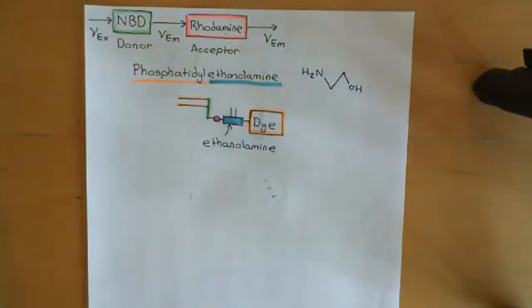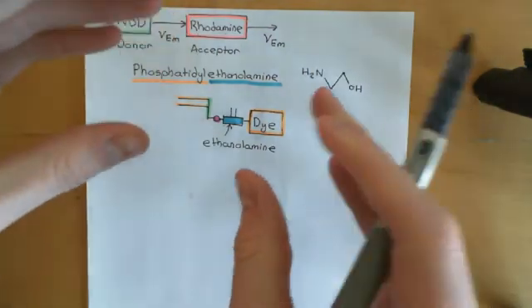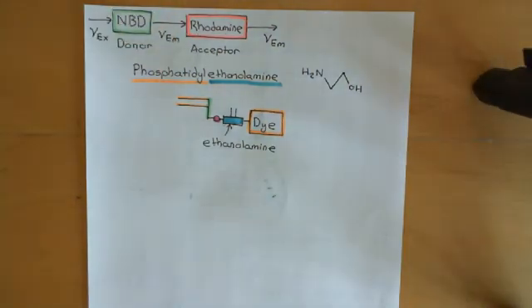Very conveniently, attaching the dye molecule onto the phosphatidyl ethanolamine doesn't hugely affect its fluorescence properties. We do it in such a way that the means by which we've attached it is far away from the portion that is participating in the fluorescence activity, so it doesn't affect that. So the idea is that we're going to attach these dye molecules, NBD and rhodamine, onto phosphatidyl ethanolamine.